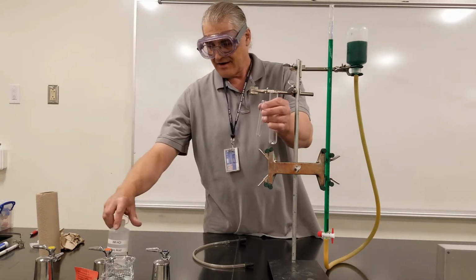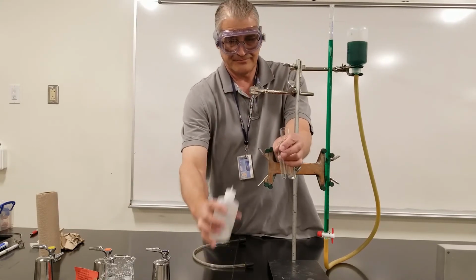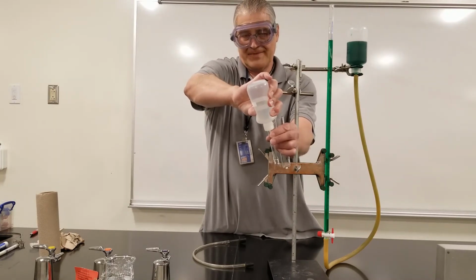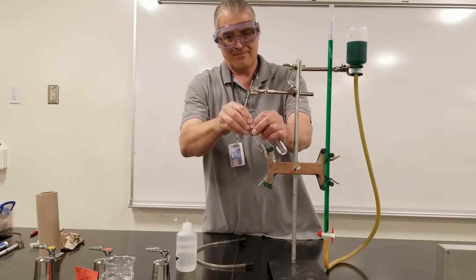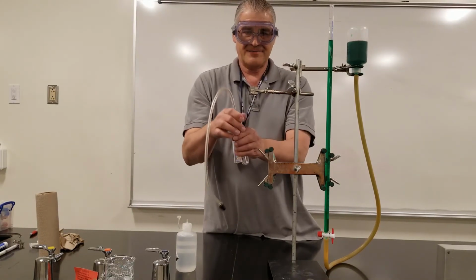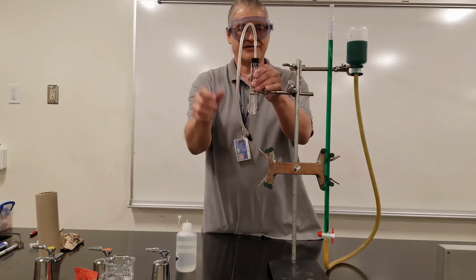You take hydrochloric acid, you add it to this small tube, plop it in there, you put this tubing together, and we'll explain the little leveling bulb here in just a moment.